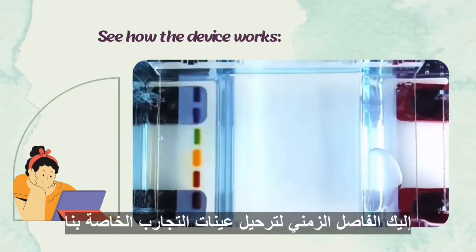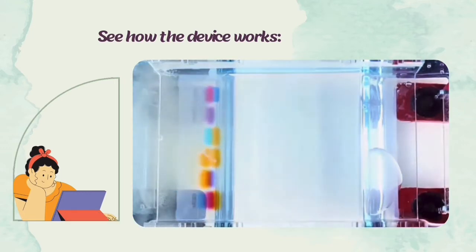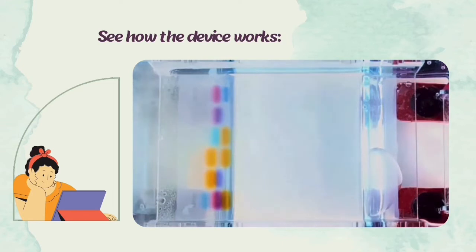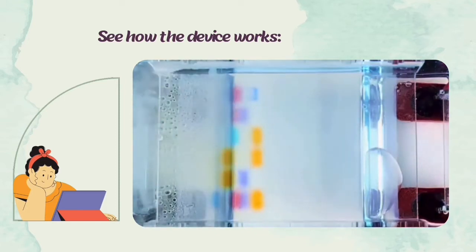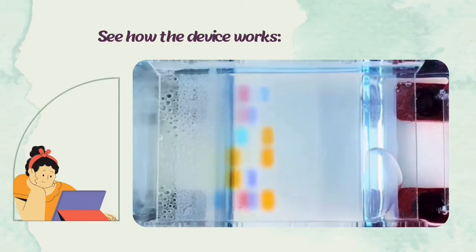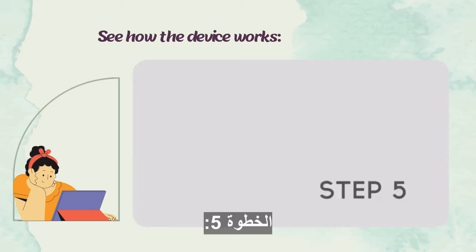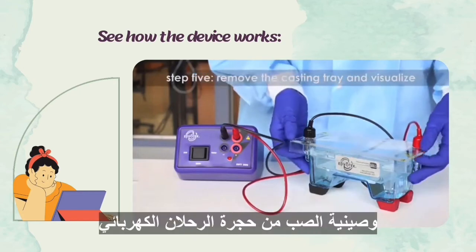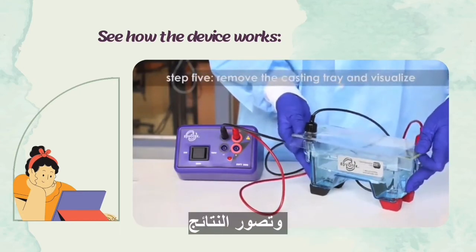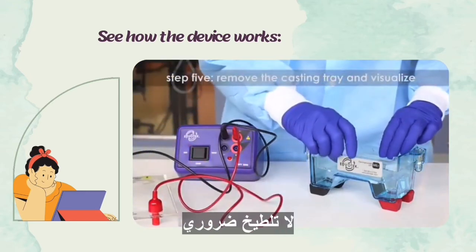Here's a time-lapse of our experiment samples migrating. Step 5. After electrophoresis is complete, remove the gel and casting tray from the electrophoresis chamber and visualize the results. No staining is necessary.